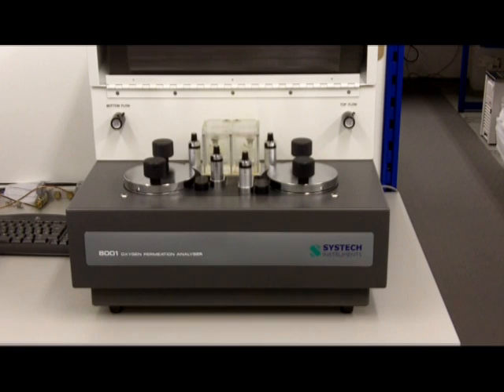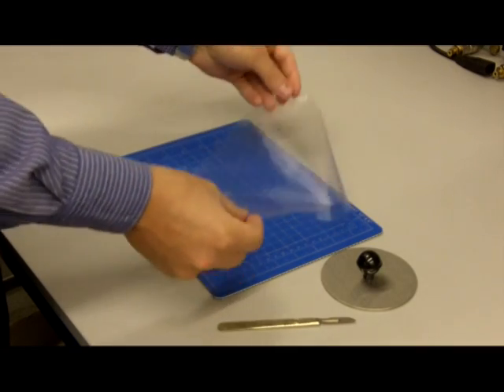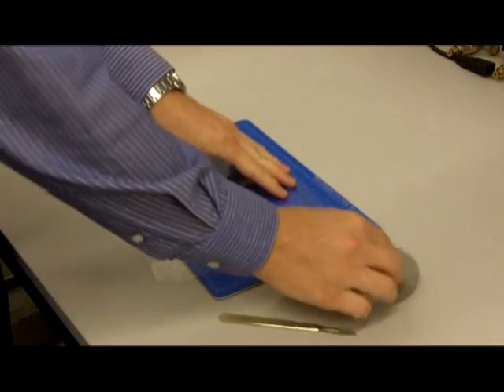Now let's look at cutting a film sample and starting a test. First choose the film you want to test, then place it on a clean cutting surface.